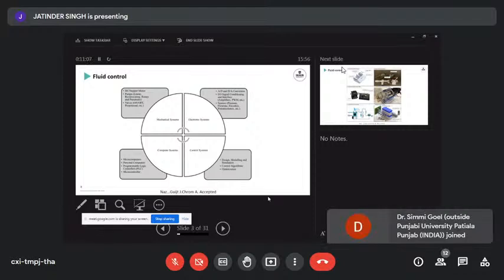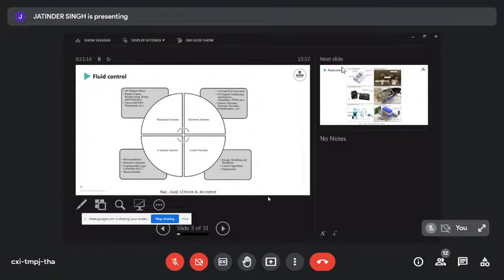They don't work by themselves, so we need a control algorithm saying under what conditions what part of the system does what. And then we need a computing system that orchestrates whenever these parts go on or off, whatever is happening with the signals coming in from the sensors. So if the pressure is above so many bar, then the pump should be switched off because otherwise my tubing jumps off.